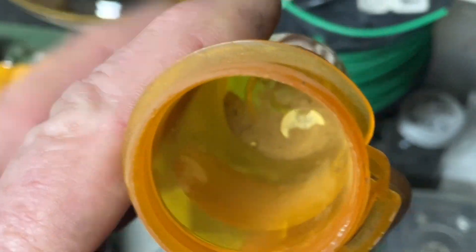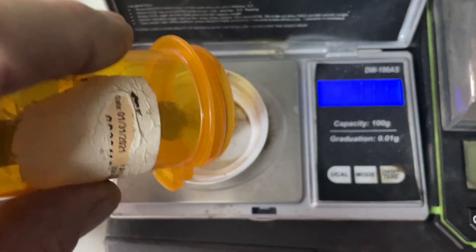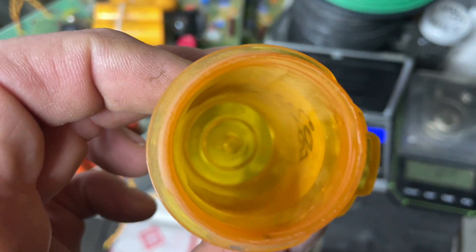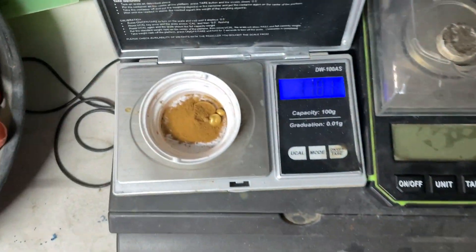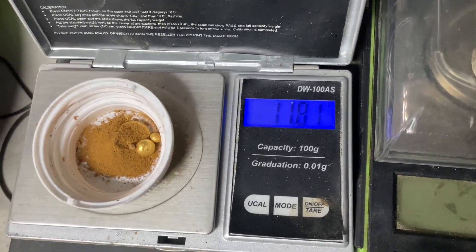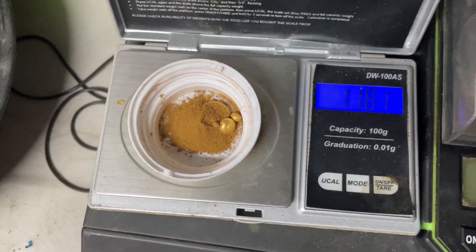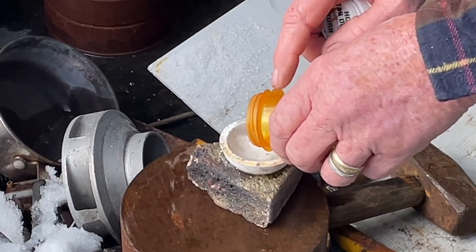I got a turned-out scale here, got a little bit of gold — some powder, a couple small buttons. Dump them all in here. Okay, what do we got? 11.81 grams. Yeah, 11.81 grams of gold. I'm gonna melt that up into a button. Fairly clean crucible — 11.81 grams of gold.